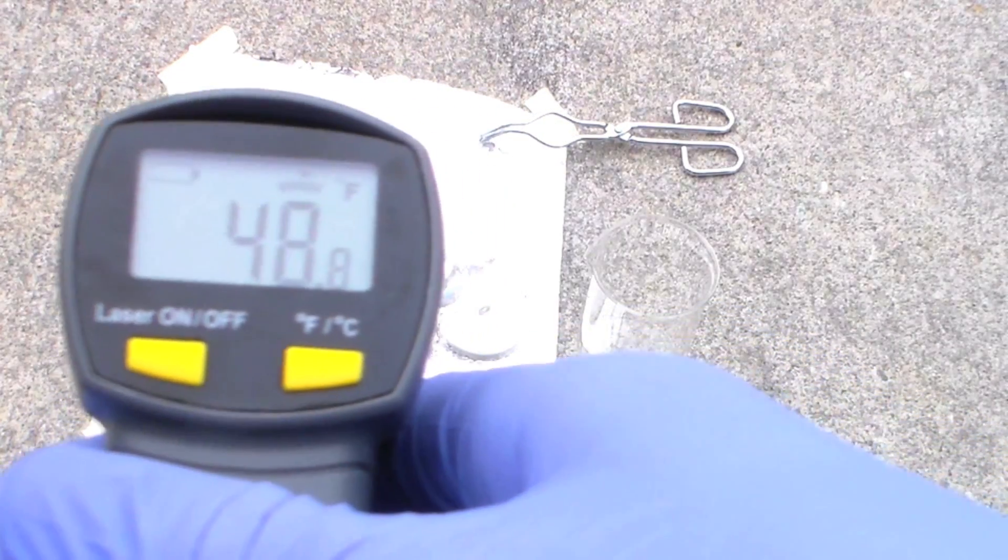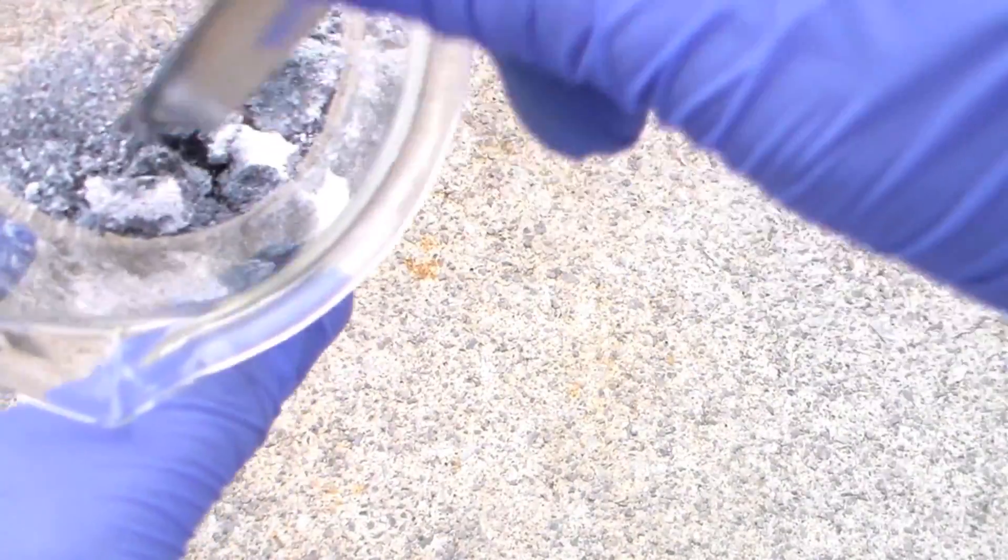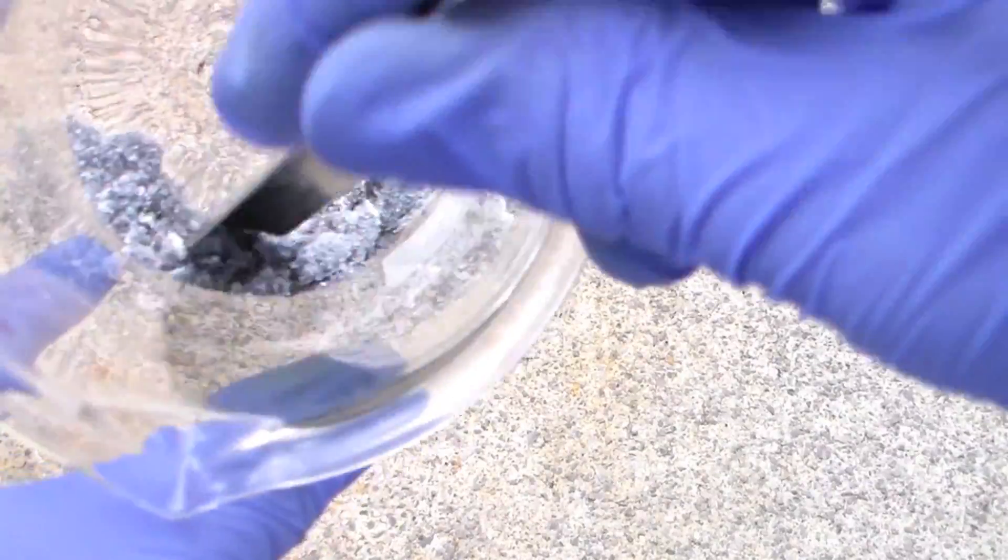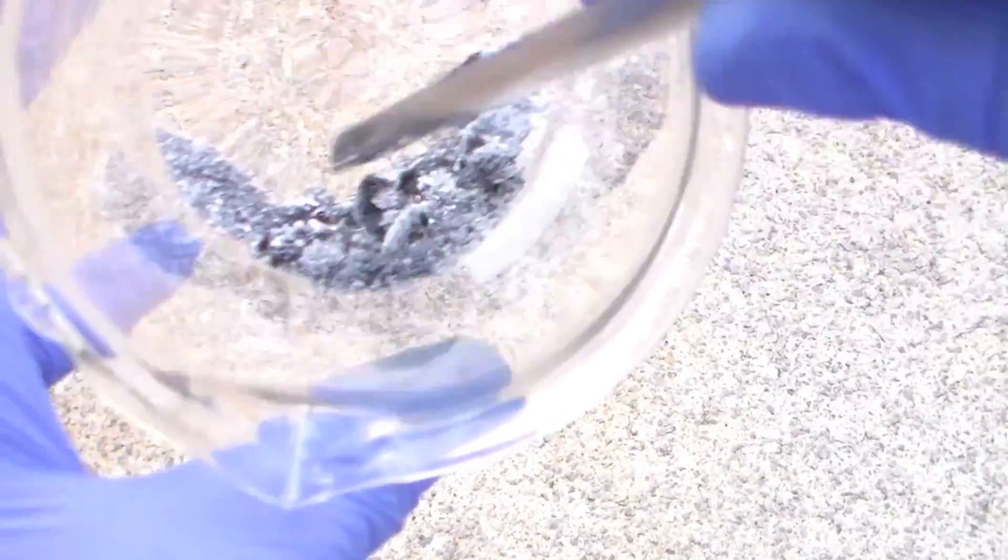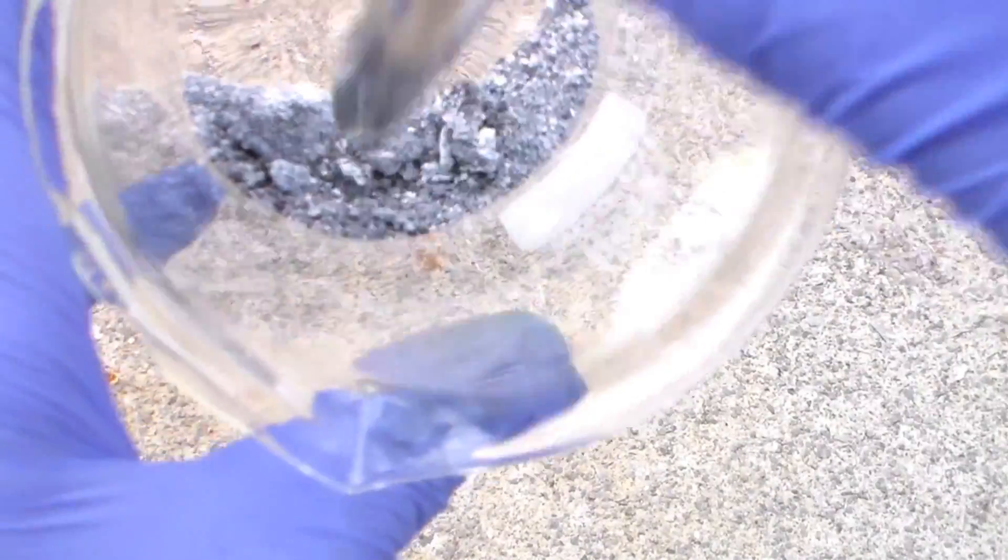Once the products were cool enough to touch, I took the main clump and added it to a beaker and crushed it up. So at this point, we have a mixture of unreacted magnesium and silicon dioxide, as well as the products of the main reaction and side reaction, which are magnesium oxide, magnesium silicide, and hopefully some silicon.